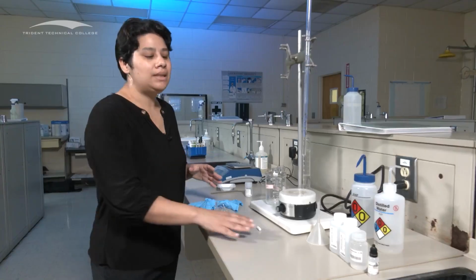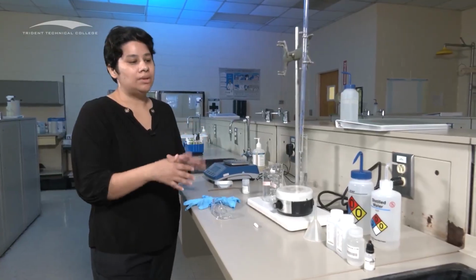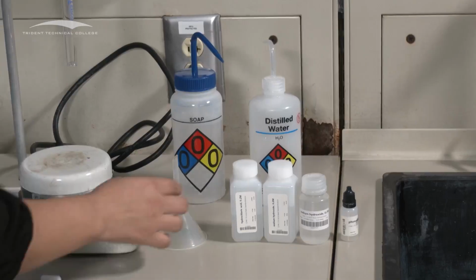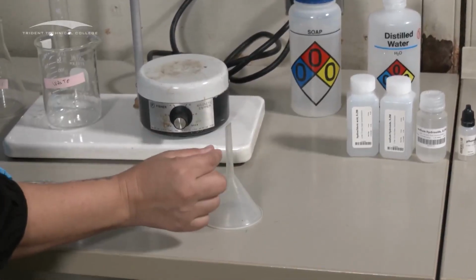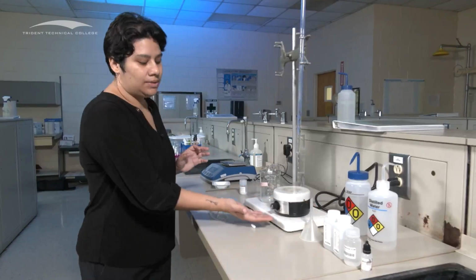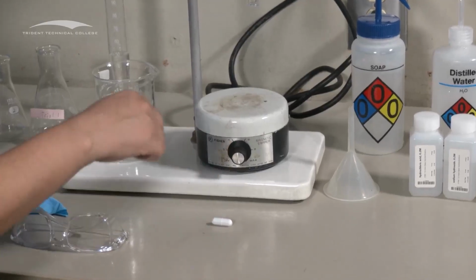Please, please double check which one you're grabbing. They look exactly the same. If you grab the wrong one, this is not going to work. Then you're going to need some sort of funnel with a very, very thin stem. Then you're gonna need this right here. This is called your magnetic stirrer. So this is gonna stir for you, so you don't have to do it manually.